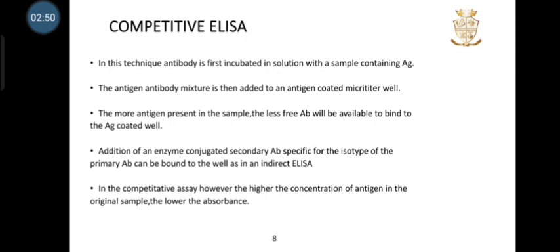Third one is competitive ELISA. In this technique, antibody is first incubated in solution with a sample containing antigen. The antigen-antibody mixture is then added to an antigen-coated microtiter well. The more antigen present in the sample, the less free antibody will be available to bind the antigen-coated well.